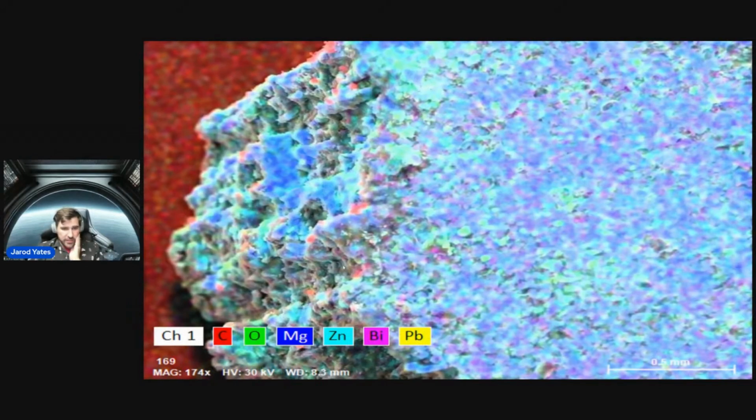Also, and this is going to come in important in a little bit here, these red spots of carbonization, you see those on the edge, specifically on the points. So something caused this thing to have carbon deposits occur at sharp edges, almost like it maybe was in a high voltage environment of some kind, potentially. Just throwing that out there.